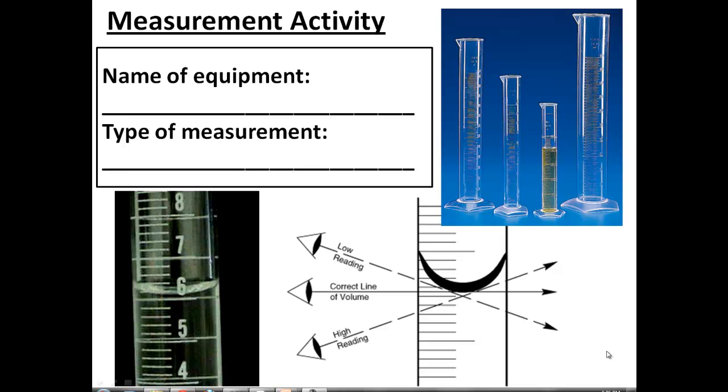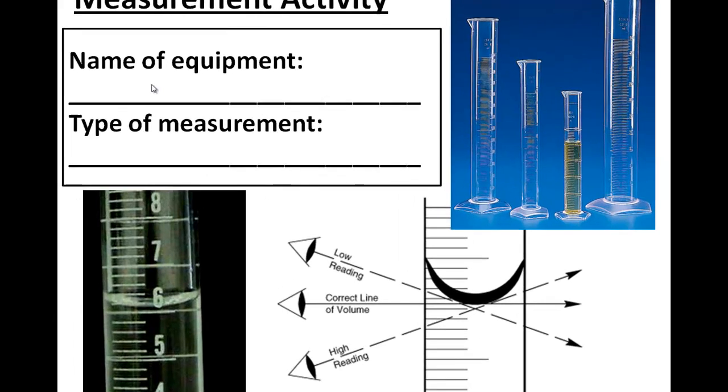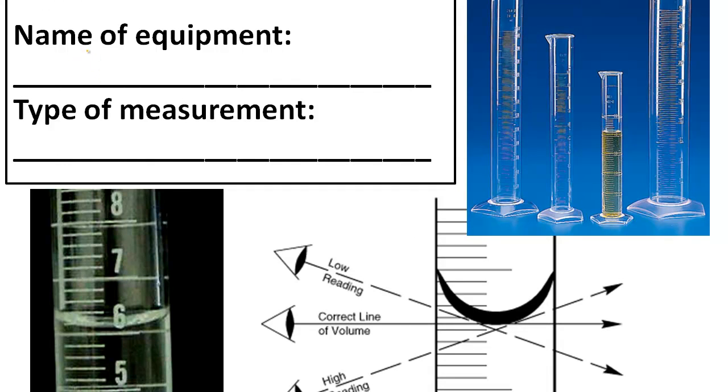We're going to find out we have quite a few things here that are going to measure the volume of a liquid. And we're going to start with this one right here. This is what's called a graduated cylinder. Graduated. What does graduated mean? It actually has all these marks. It's graduated into a certain unit of volume. And this is a cylinder because that's exactly what it is.